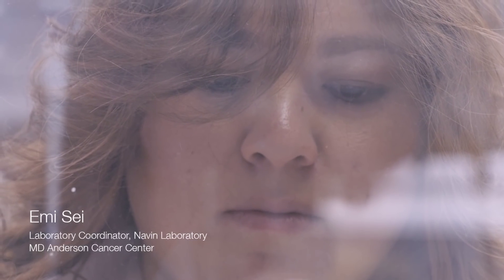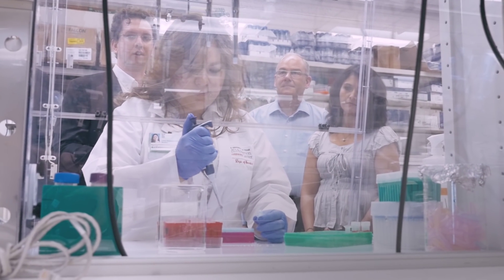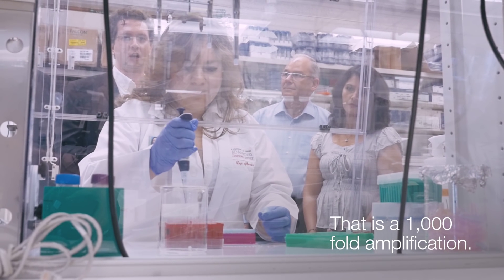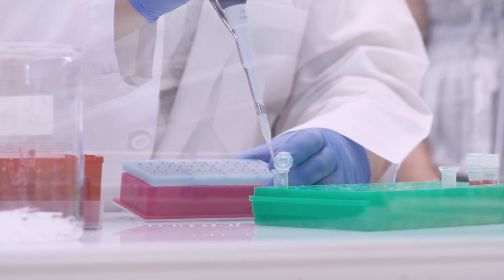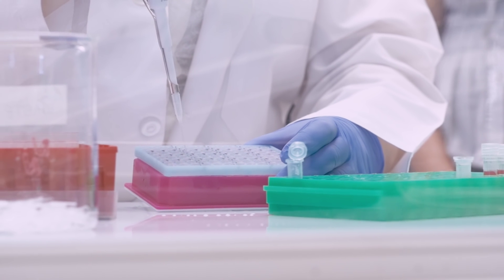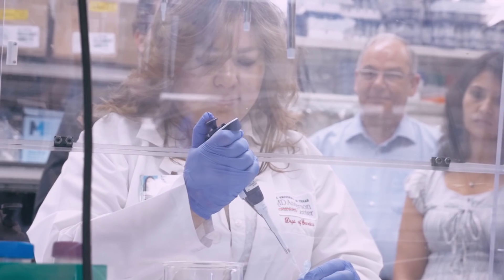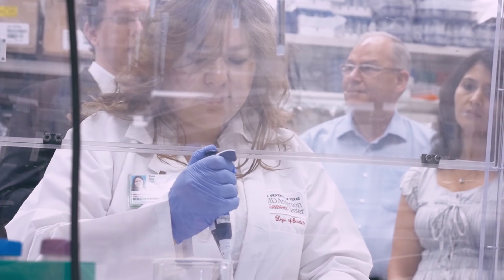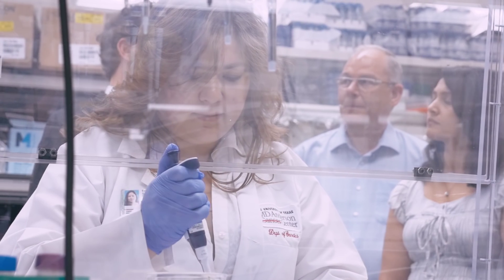So now we're going to go through the whole genome amplification process to amplify the DNA from six picograms up to nanogram amounts so that we can generate sequencing libraries and do our quality control steps. All that work has to be done here under a clean hood which is sterile, and it's very critical before the DNA has been amplified not to contaminate it with any bacteria or even viral DNA.